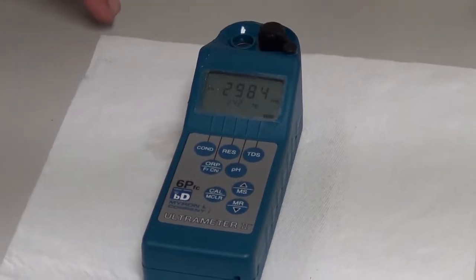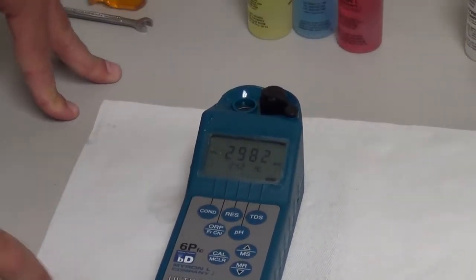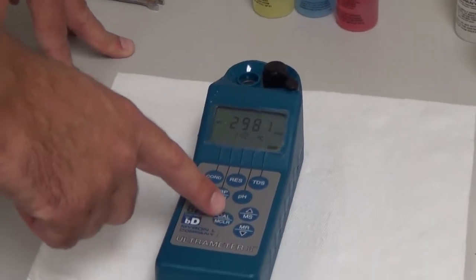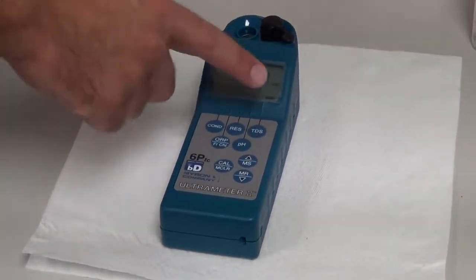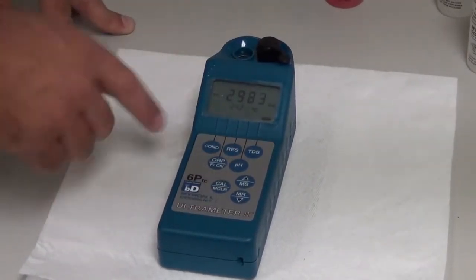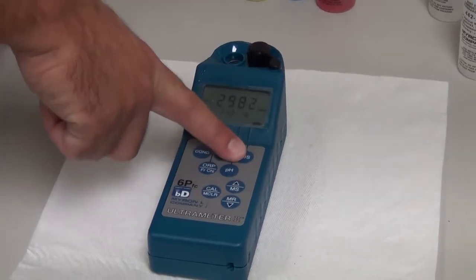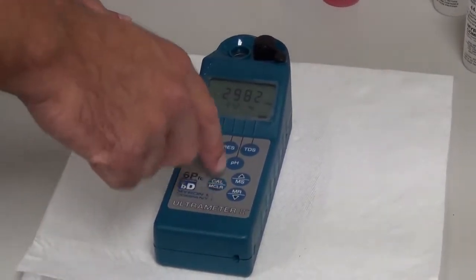Give it a second to allow the reading to settle, and then I will go into the calibration mode. If the display turns off in the middle of your calibration, it's no big deal. Just go ahead and press the parameter button that you're working on at that time. In this particular case, TDS, being the mode that we're in.